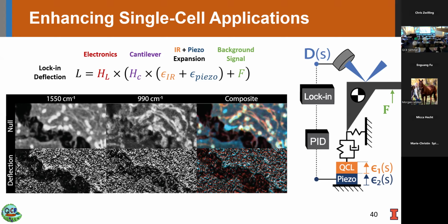Can I add something? It's difficult to do that in the sections that we work in here, because at that level, autofluorescence majorly dominates a lot of it. We've tried staining. The nucleus and such you can obviously do, but if you try to look at other finer details in the sections, it's very difficult to point out something. You can obviously do it in full whole cells, but it's difficult at this moment.